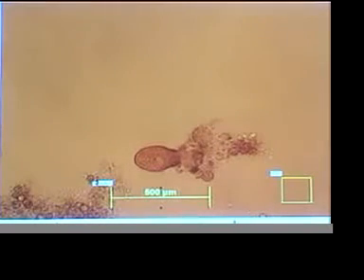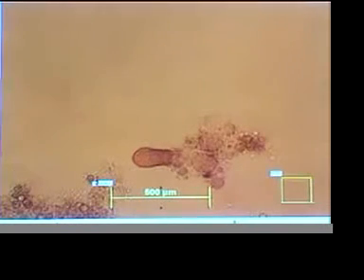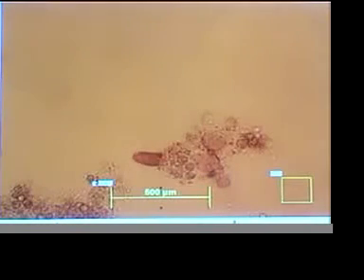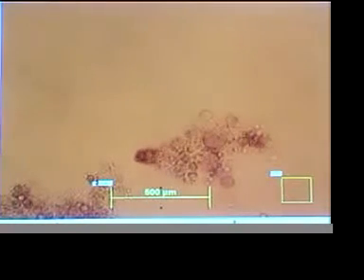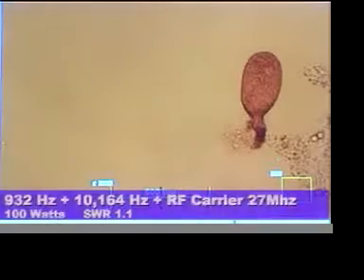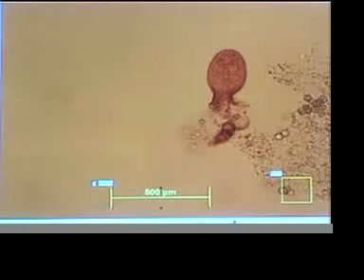932 Hertz. He held out for quite a while. 1,041 seconds it took to break this guy down. Yet, many organisms are still living on the slide. But he has some neighbors who are not swimming. Here's one I believe is about to begin a disintegration. He has that look about him. Indeed, there he goes. I'll center the picture. It's a live disintegration, devitalization of a Blepharisma.